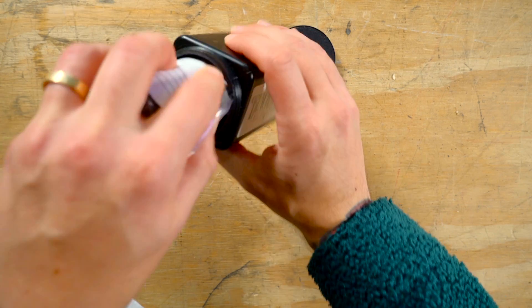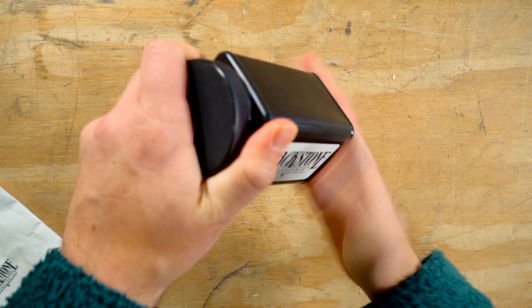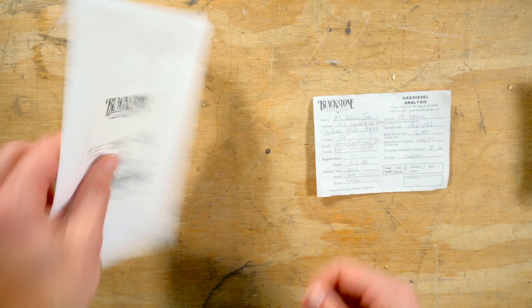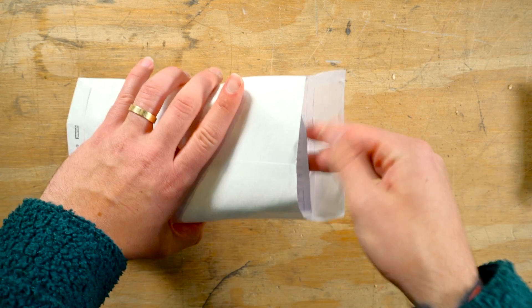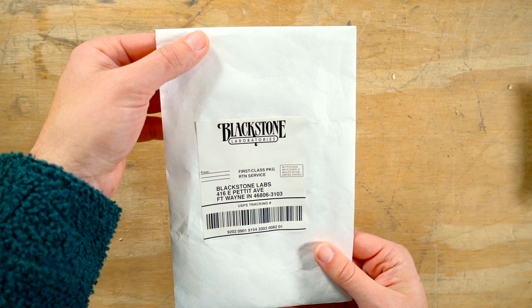Either you can roll the slip up with the sample bottle and include it in the black mailer, or you can place the slip in the envelope outside of the mailer. For more details on how to fill out your oil slip, check out our video Oil Slip 101.